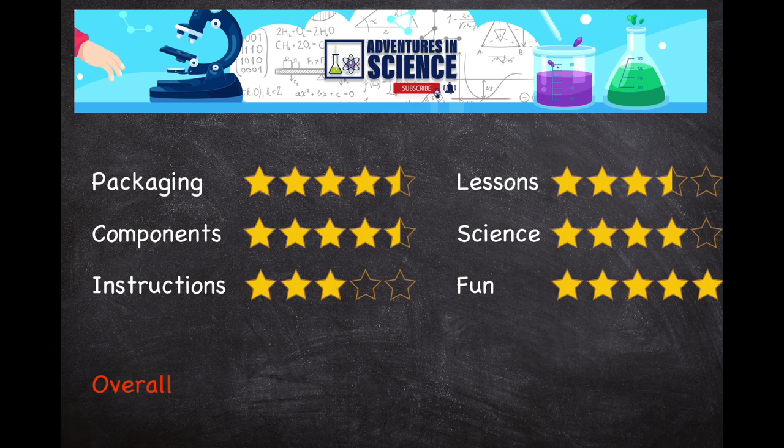Fun, a good solid 5. Kids are going to love scouring the house and the garden looking for specimens, anything they can find to put on a slide and look at. There's going to be a lot of excitement seeing things wriggle and move under the microscope. It's just another whole perspective on the world. Overall I give this kit a solid 4.